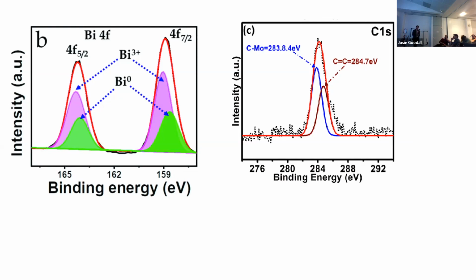Your resolution, we measure points in XPS that are much tighter resolution. Yes. Well, I guess it's the same thing in most powder patterns. Most powder patterns, you have many points across the reflection. So your total number of observations is normally very high. So the theoretical number of parameters you could refine against that is the number of observations, but realistically you will want to refine far fewer than that, because you're limited by that kind of model, but XPS, maybe not.